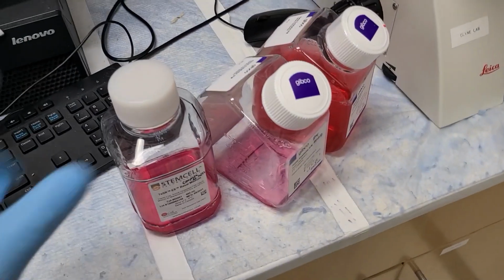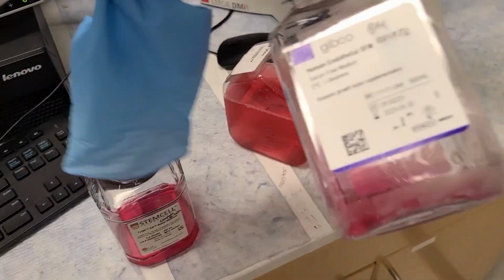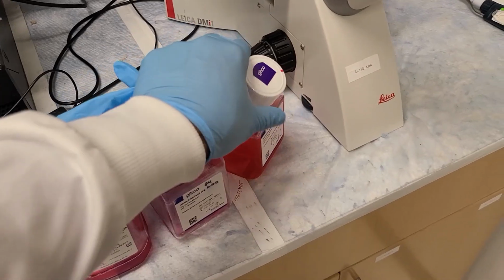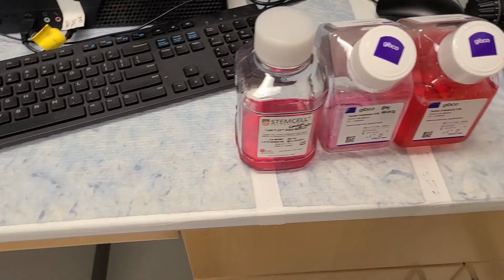So I'm here today to feed some cells, set up some experiments, and I'm just gonna show you what it's like. So first things first, taking out some of my stem cell media, letting it warm up at room temp so that I can feed my cells without cold shocking them.